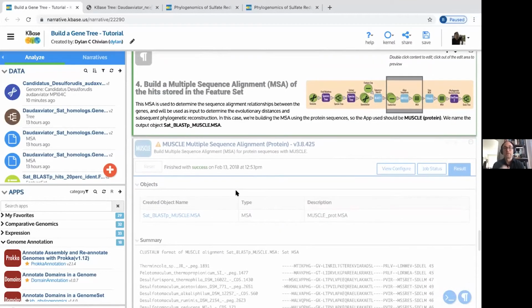And so we're going to build a multiple sequence alignment of those. The typical steps in phylogenetic reconstruction is you build a multiple sequence alignment, you trim it for variable regions if the sequences that are present in it are normal distance or greater, because there are often these variable regions that are less phylogenetically informative. They may correspond to loops in a protein or something like that, which are more rapidly diverging than the core scaffold of that protein.